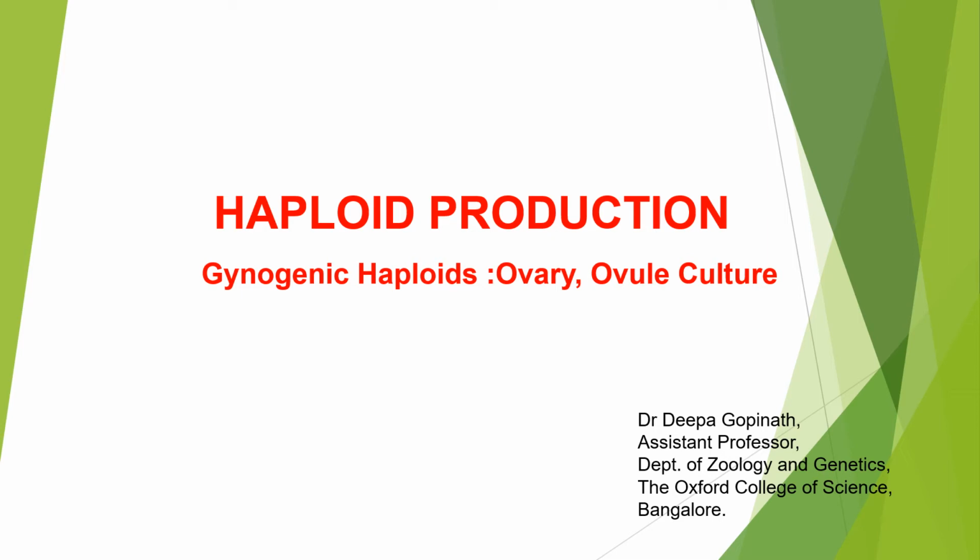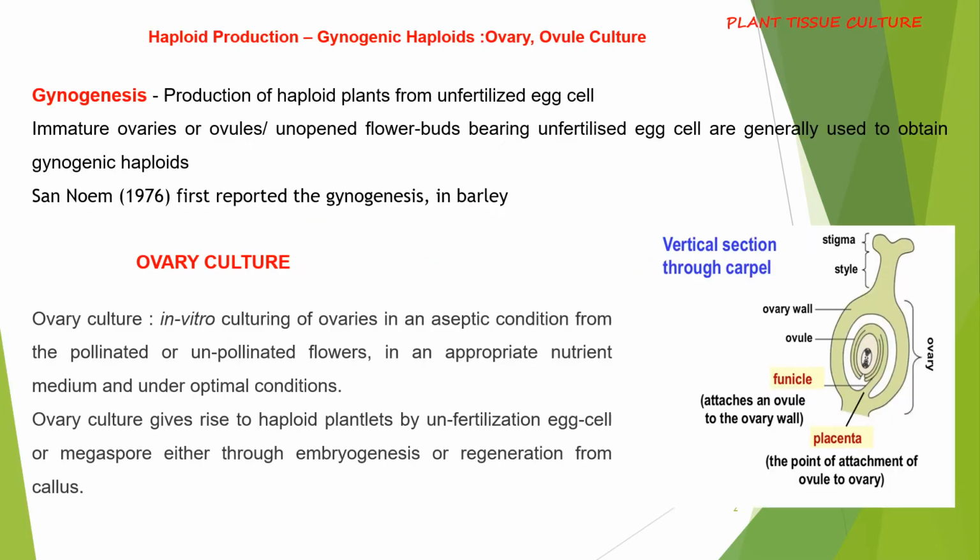The topic of the day is haploid production by means of gynogenesis, ovary and ovule culture. Gynogenesis is a technique of production of haploid plants from unfertilized egg cells.